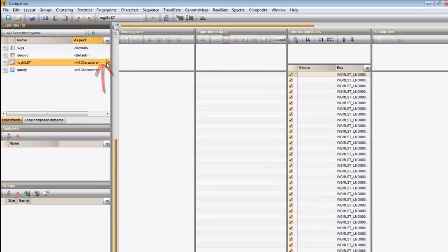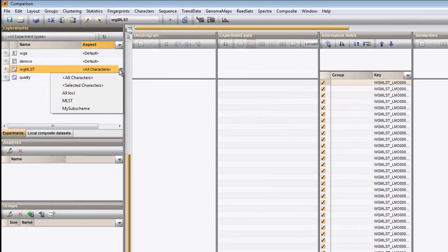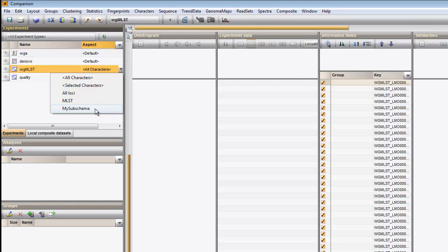By default, select all characters is used, but this can be modified using the drop-down menu.